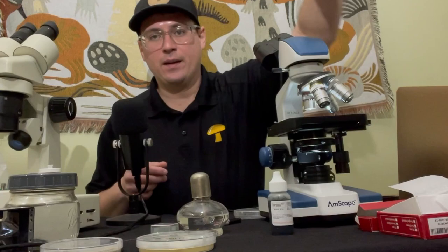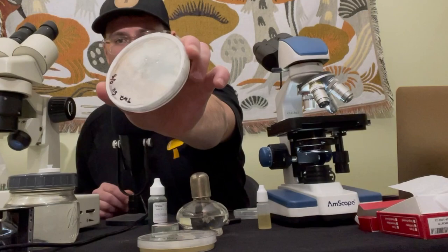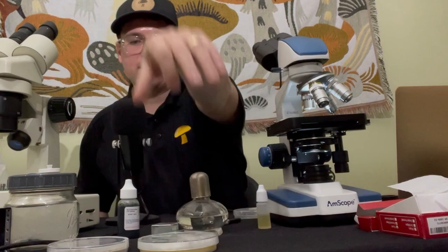On the next two dishes, I've got some lion's mane mushroom and an unknown mushroom that I'm going to be using bromothymal blue and a scotch tape prep on, so that we can search for clamp connections. Or I just want to look at this lion's mane mycelium to see what it looks like when it's stained.